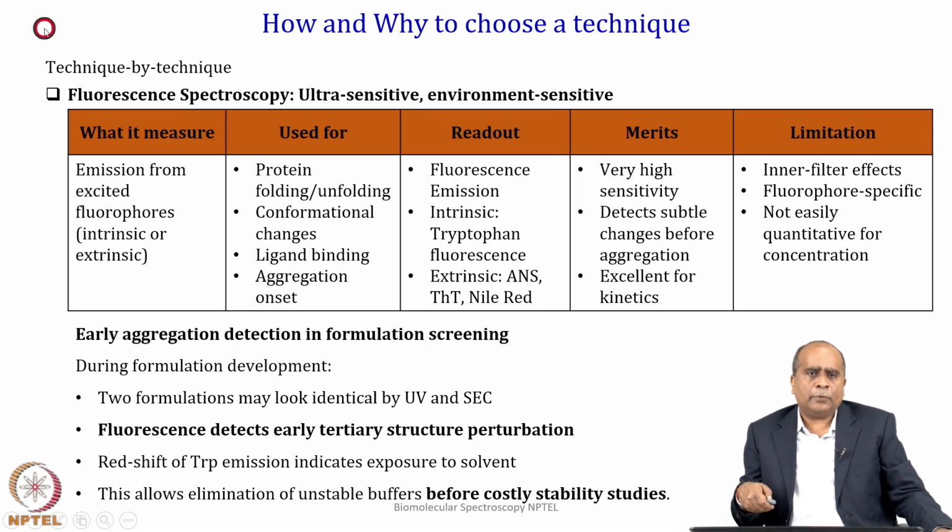Now, another one, fluorescence. It is an ultra sensitive technique, an environment sensitive technique. What we measure is emission from an excited fluorophore, whether it is coming from an intrinsic fluorophore or an extrinsic fluorophore. Basically, it is used for protein folding, protein unfolding, conformational change. We can study ligand binding and the aggregation onset, very important. Protein therapeutics tend to aggregate, and those can be very dangerous. So, fluorescence is a technique that can help you in understanding this aggregation onset.